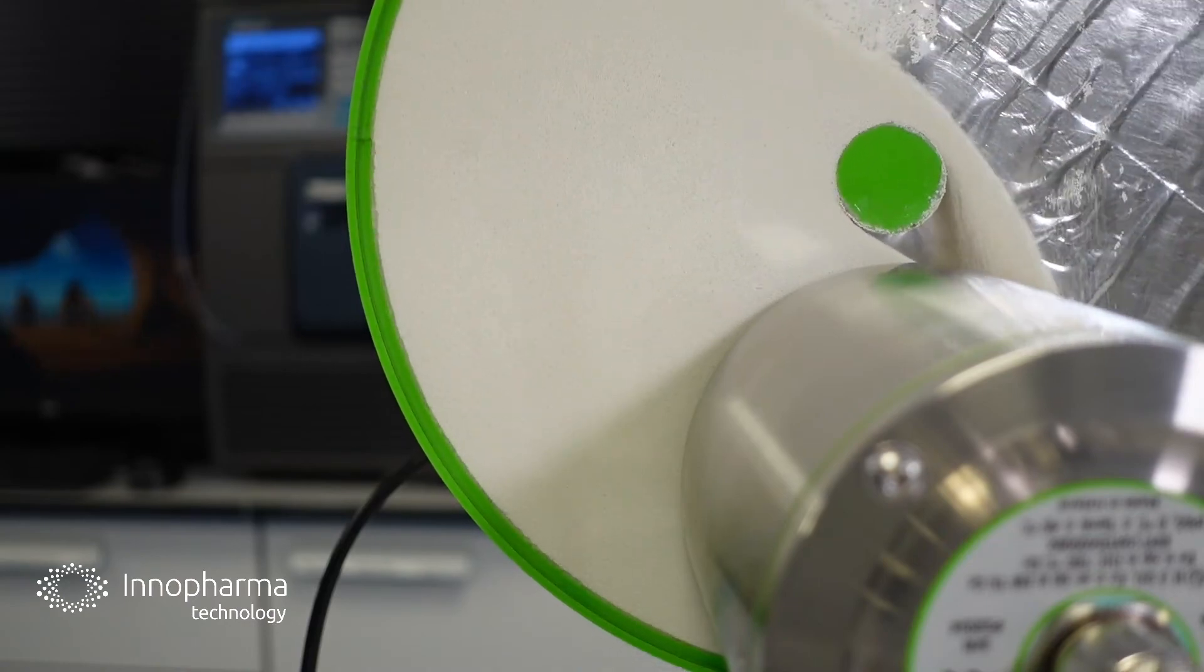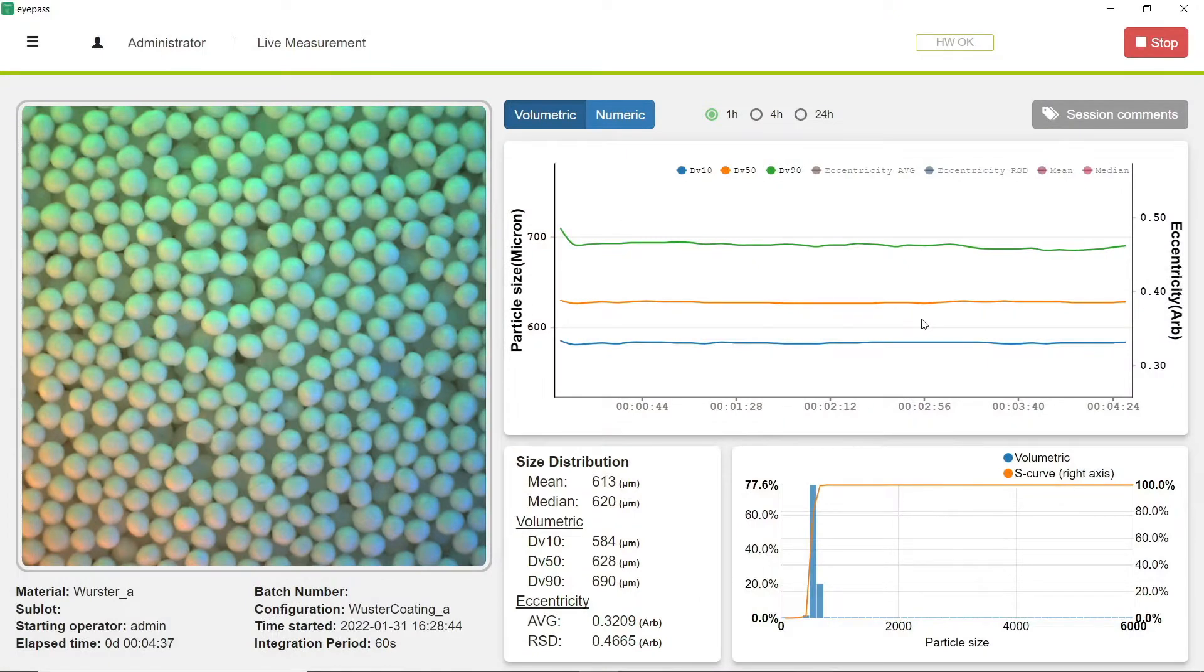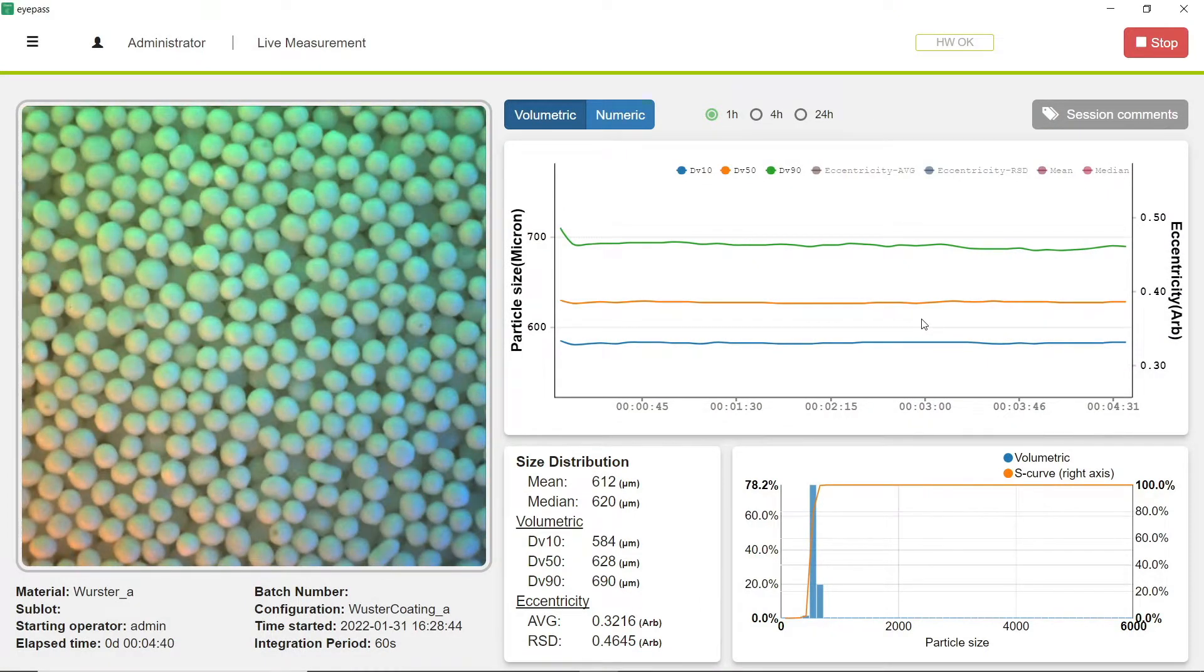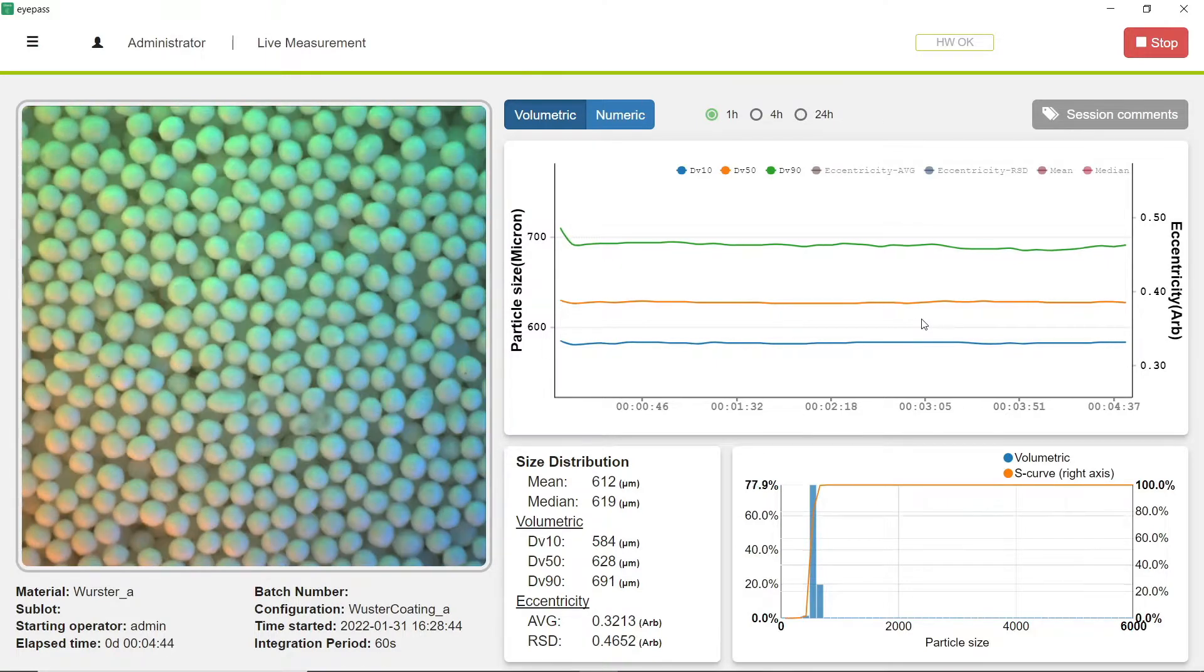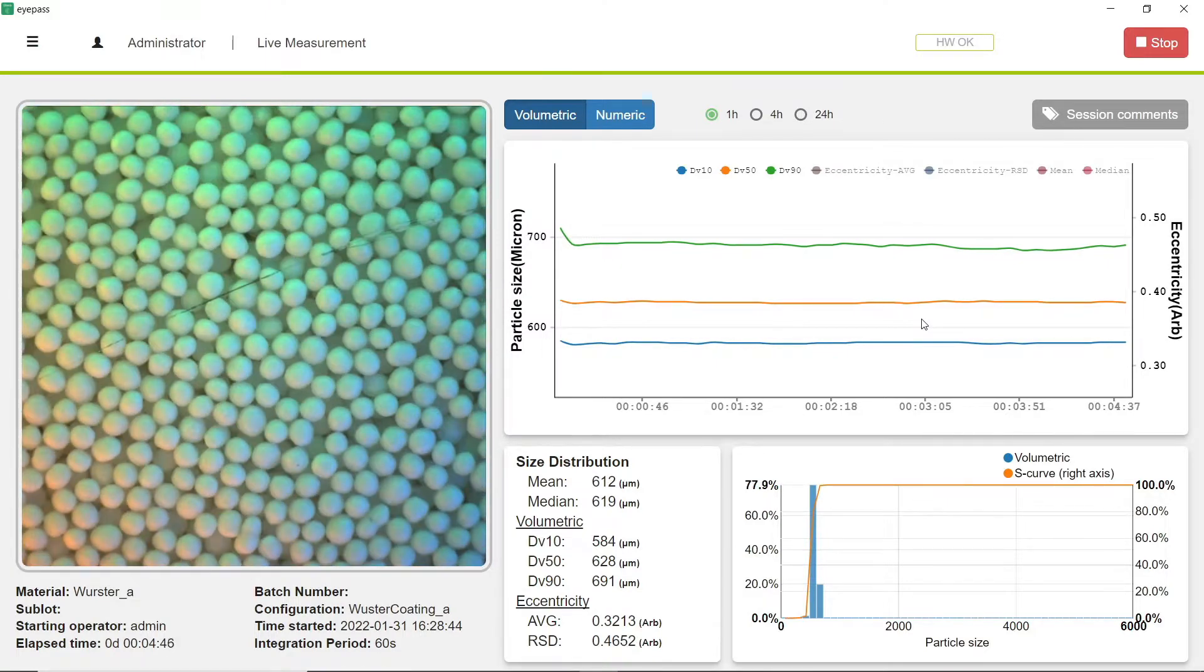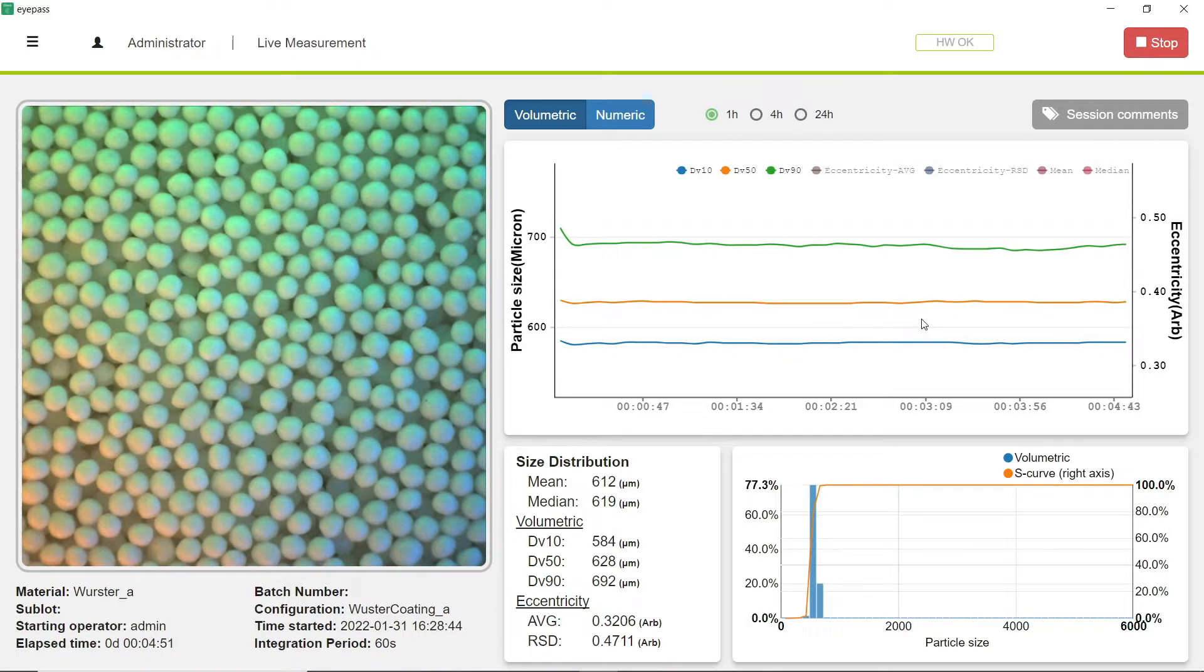And if we go further to look at its software I-PASS running, this is I-PASS version 3.0 now with our built-in machine learning image analysis. We can see we're getting our data here in real time reported back to us in a non-product contact fashion, and we can see the D10, the D50, and the D90 being reported back as 628 for the D50 average.